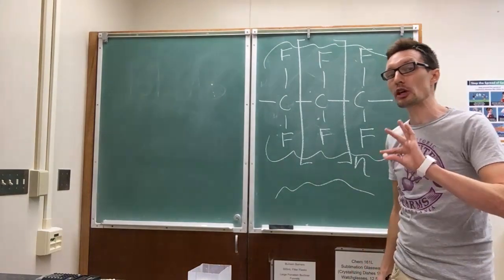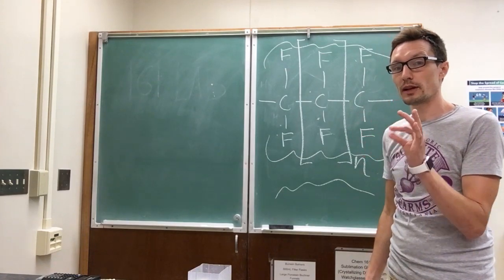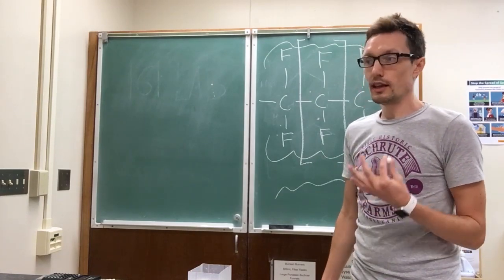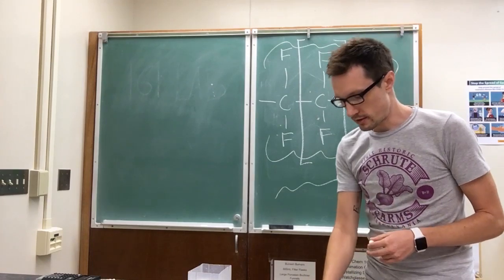And so the reason why it's good for us to have these pellets made of Teflon for measuring their density is that we're going to use water. We don't want water to stick to the surface. We don't want water to be absorbed into the item, into the particle. Otherwise, it might throw off our measurements.